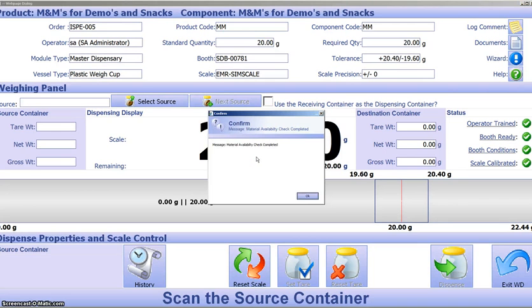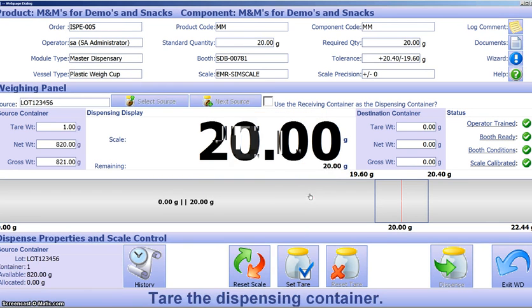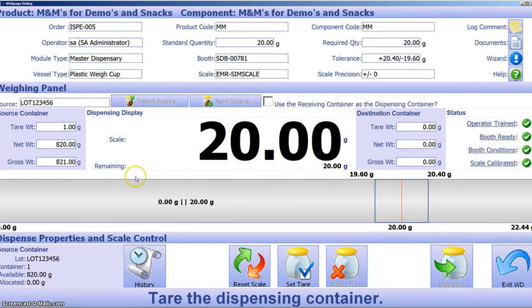And the first thing we do is go back to the ERP system and check to make sure that the material is available and in the right state to be used. So we've got our lot number, we've got all set.